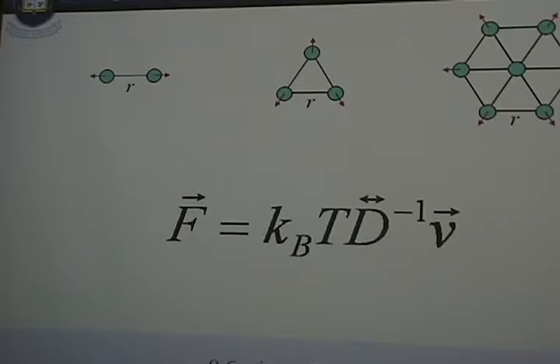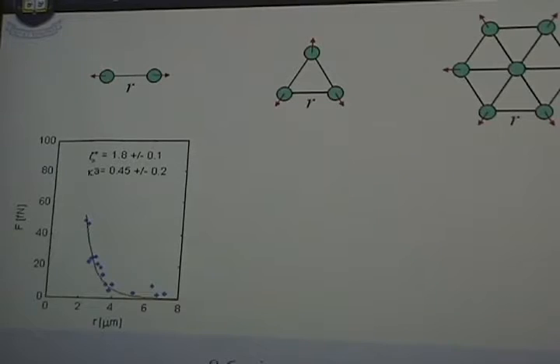And so we can take particles under identical solvent conditions, and we can measure the forces between them when there are two, when there are three, and when there are seven, and see if they add up. And so here's an example. Under certain solvent conditions, we took two particles, and we found a force versus separation that looked like this. We fit it to a theory for electrostatic interactions that told us there was a certain amount of charge on the surface of the particle and in solution.